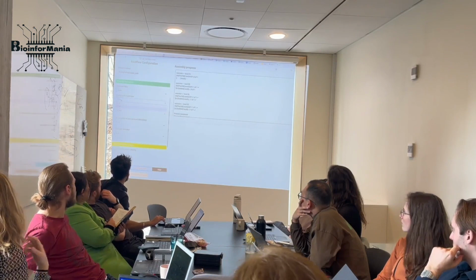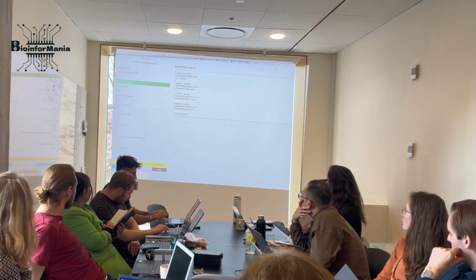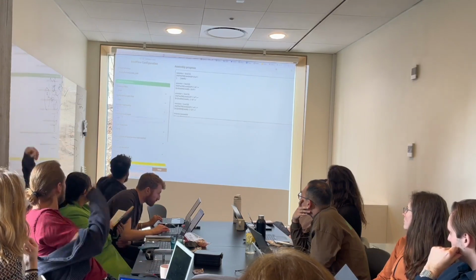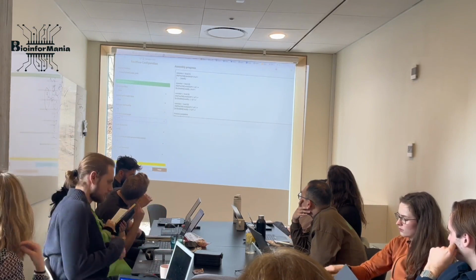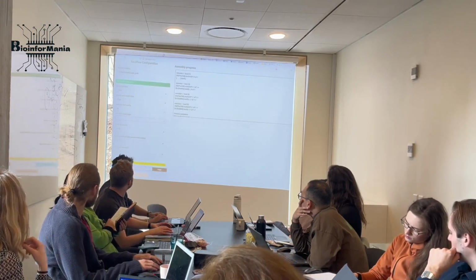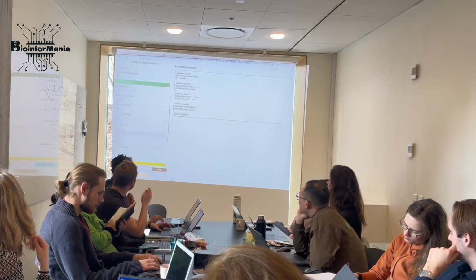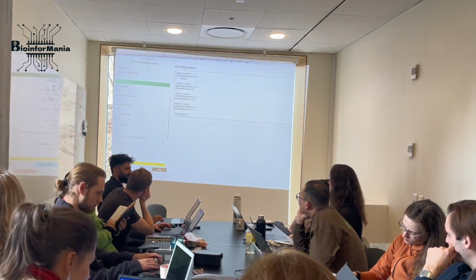Quality and read length, definitely yes. True by default. 16 is our quality, okay? Minimum quality below 16 discarded. Above 16, yes please. And then reads below 1000 discarded. Select assembler, Flye, alright? Remember those assemblers I mentioned?